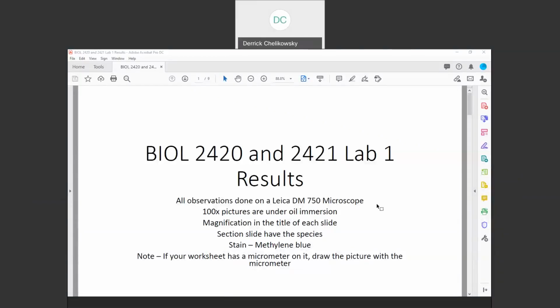Hello everyone, and this is our video on analyzing our microscopy pictures. There is another video on analyzing plates, slants, broths, and the like, and how to go about analyzing those pictures. This is not that. This is for Lab 1, I believe in both 2420 and 2421.